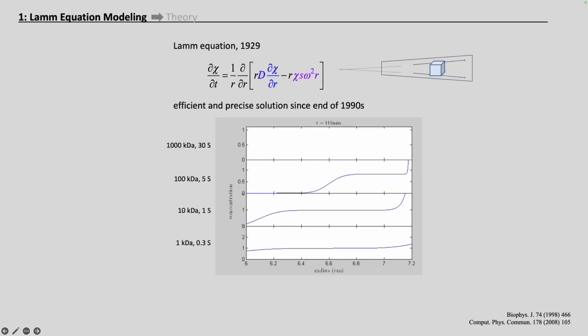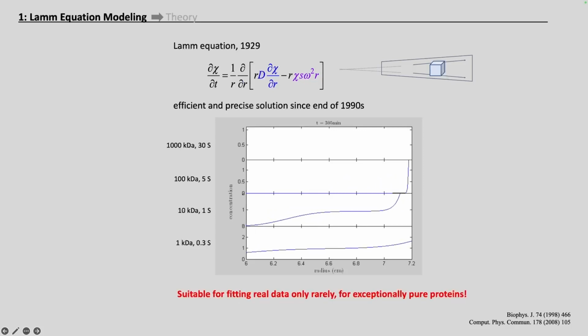And I have already mentioned that once we were able to easily compute Lamm equation solutions in the 1990s, they turned out not all too useful for directly analyzing most real-world samples with their preparative imperfections or sometimes pleomorphic and polydispersed nature. The need to avoid fitting discrete Lamm equation solutions led us to develop the sedimentation coefficient distribution c(s), which is now very popular.